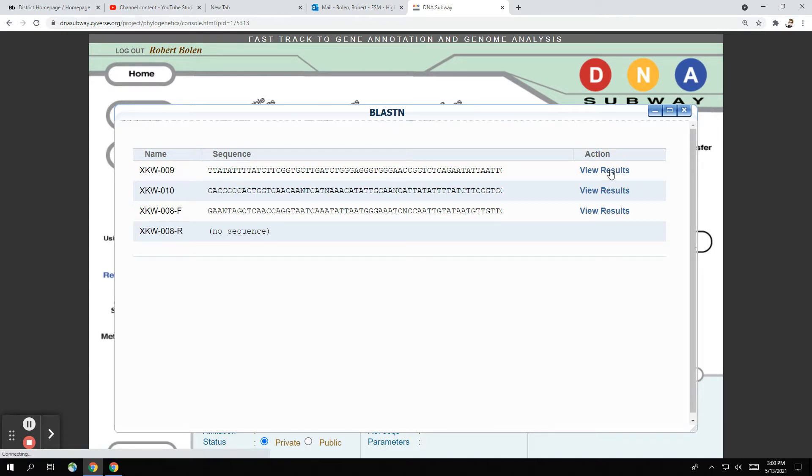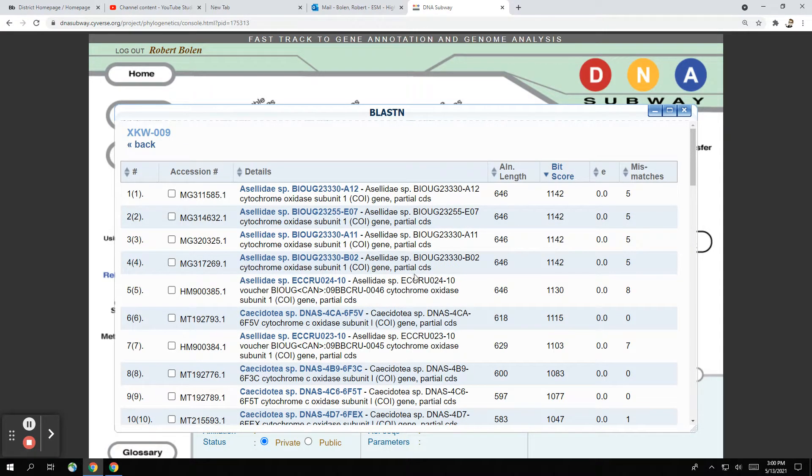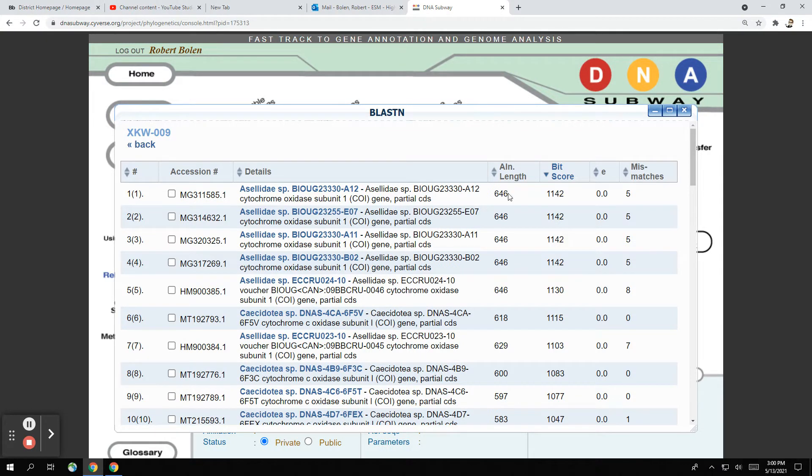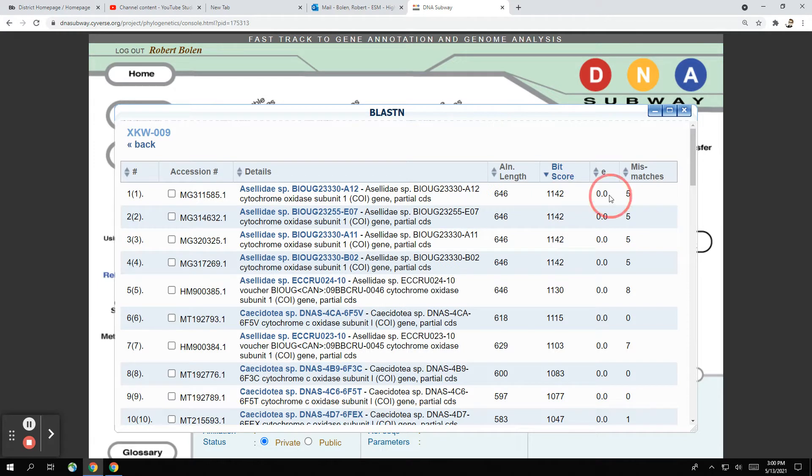So when we click on this button to view the results, we get a whole bunch of different organisms that come up. The top result is your top hit and you can see that the alignment length is 646, we have a bit score of 1142, our E-value is zero and we have five mismatches. Now what does this all mean?